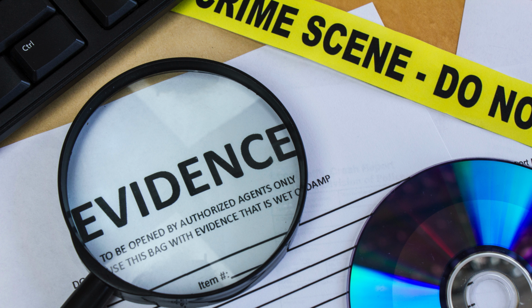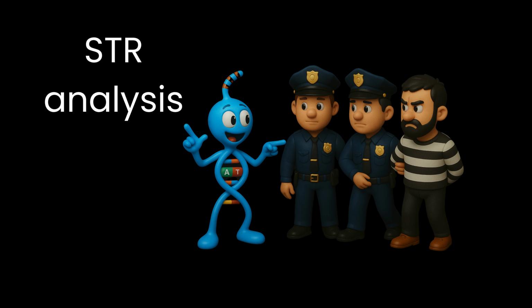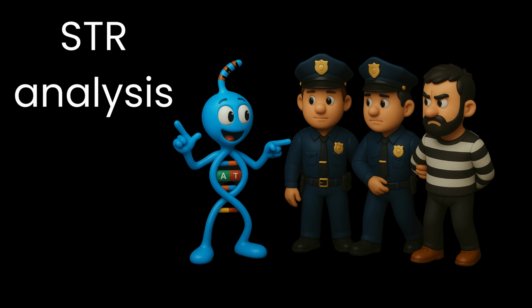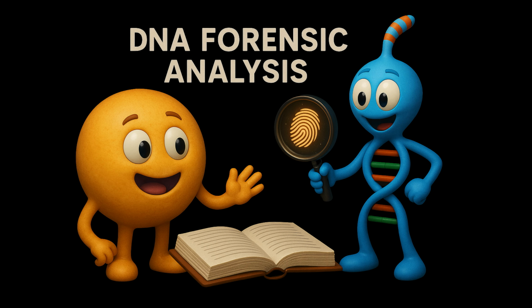When a crime leaves no witnesses, no cameras, and no obvious clues, there is one silent witness that never lies. That's DNA. And thanks to a technique called STR analysis, law enforcement can catch criminals with astonishing precision. But how exactly does this microscopic evidence help solve real world crimes? Today, let's dive into the fascinating world of DNA forensic analysis.